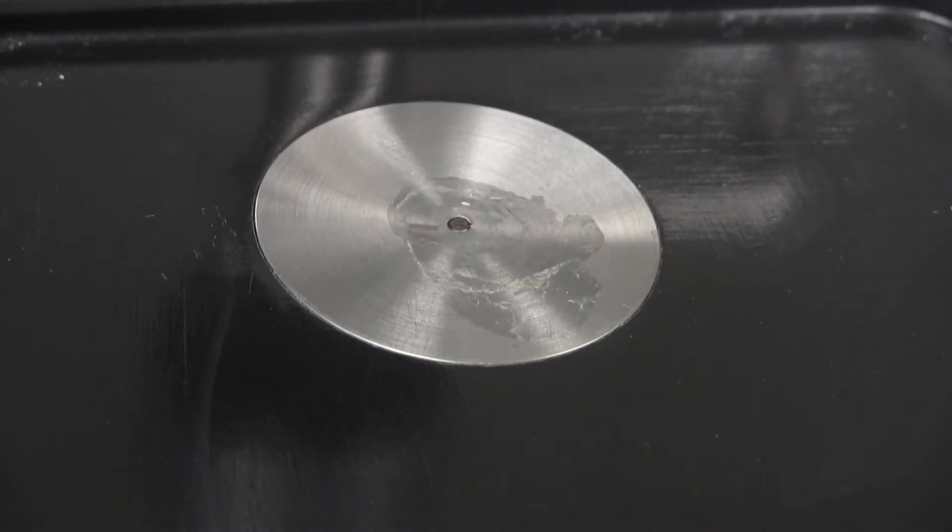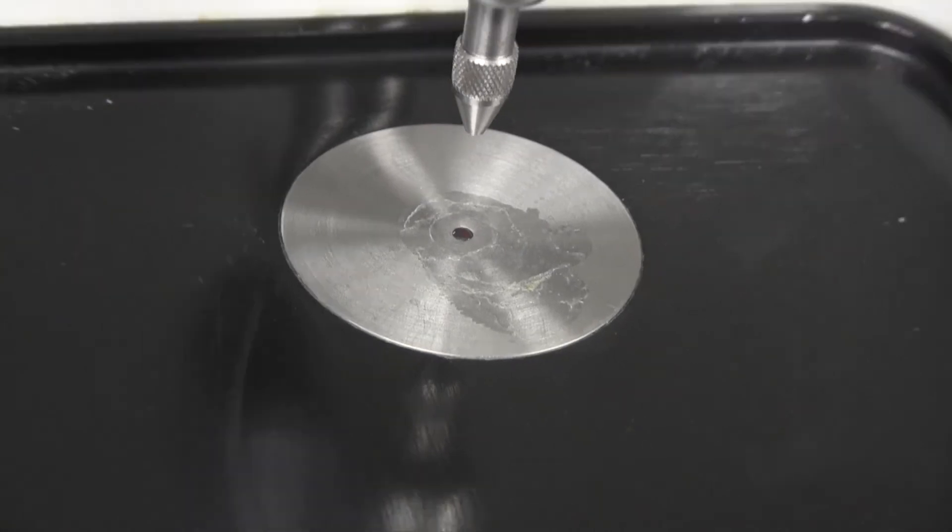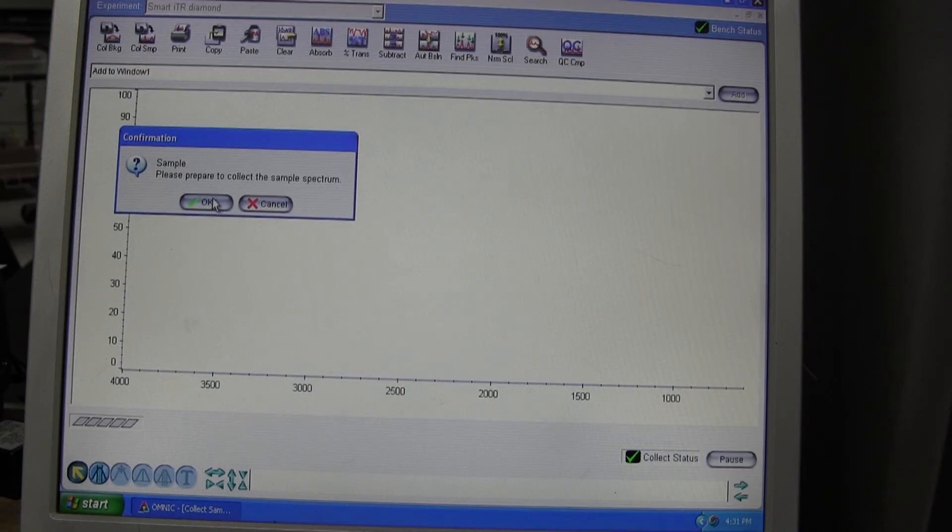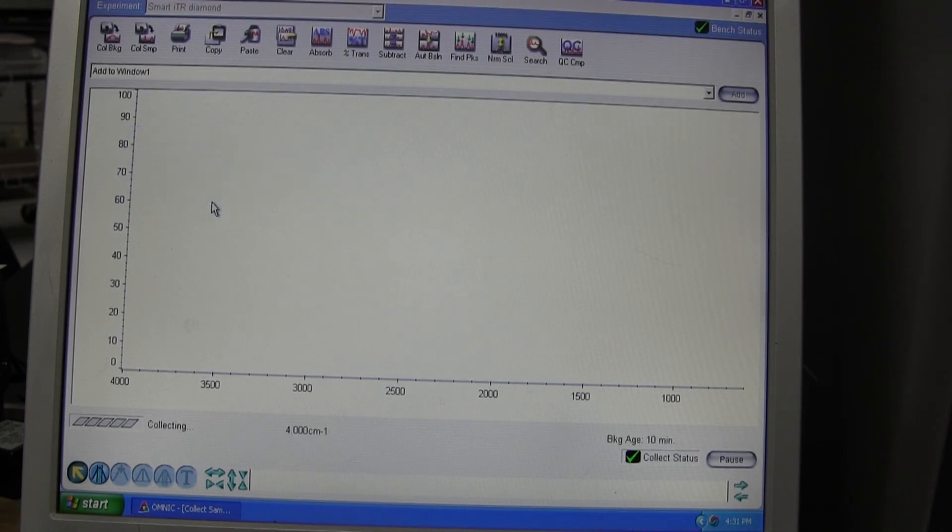You should be able to see a thin film of your unknown covering the crystal. If so, move the arm of the IR machine over the crystal and lower until you hear one click. You are now ready to begin collecting. Choose Collect Data from the pop-up window and, again, avoid bumping or touching the table.